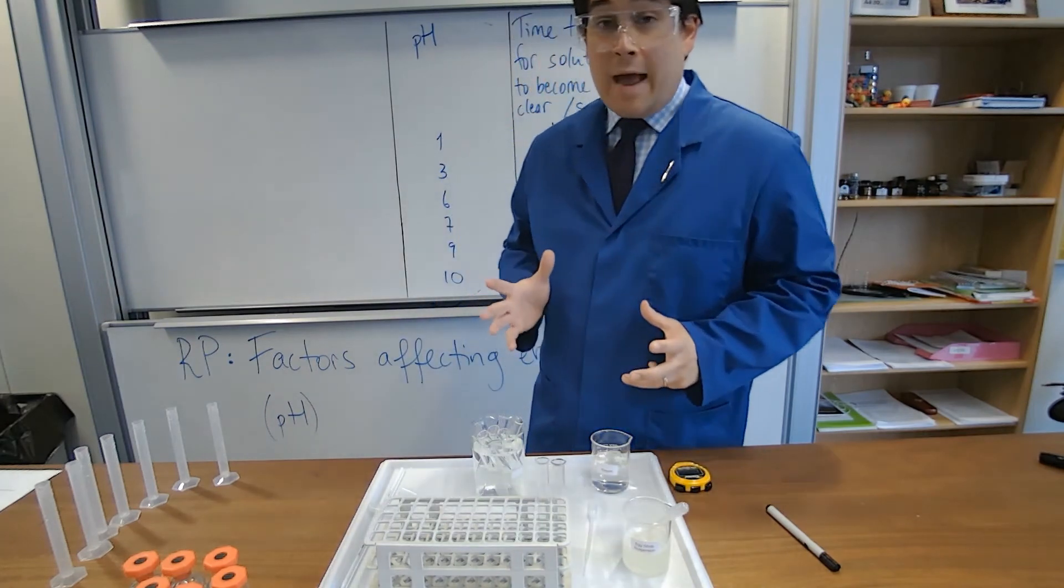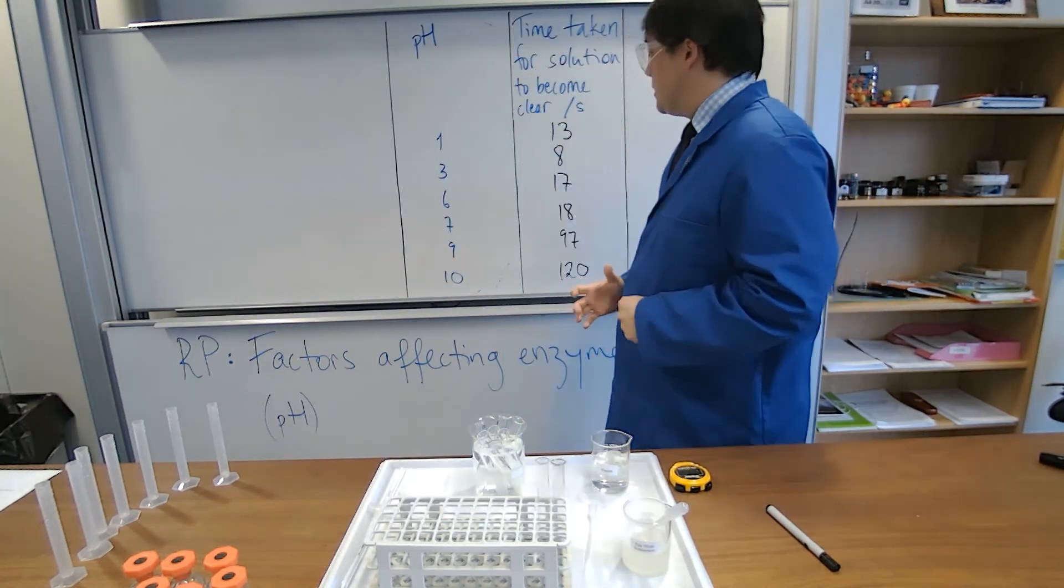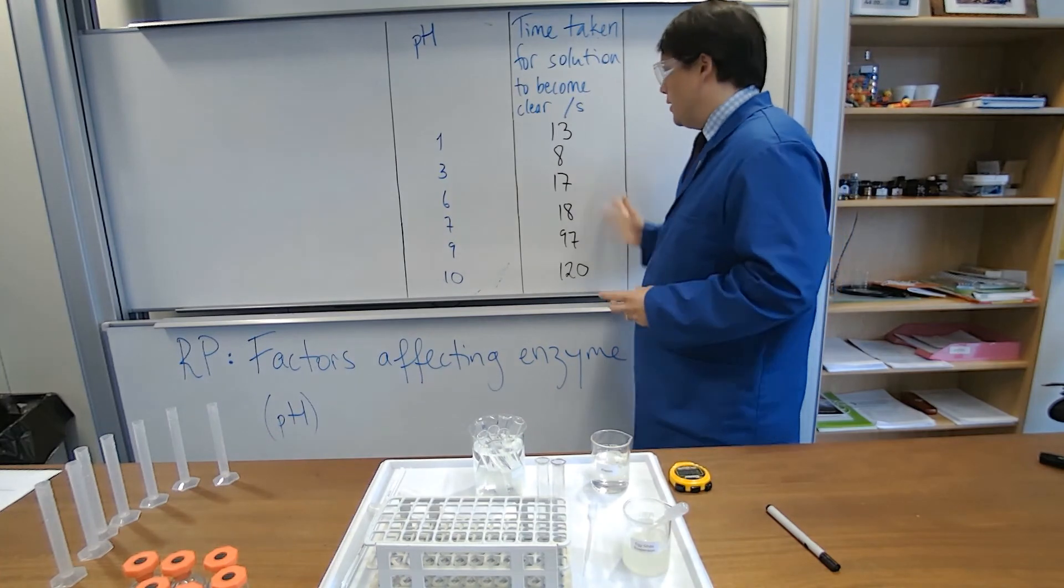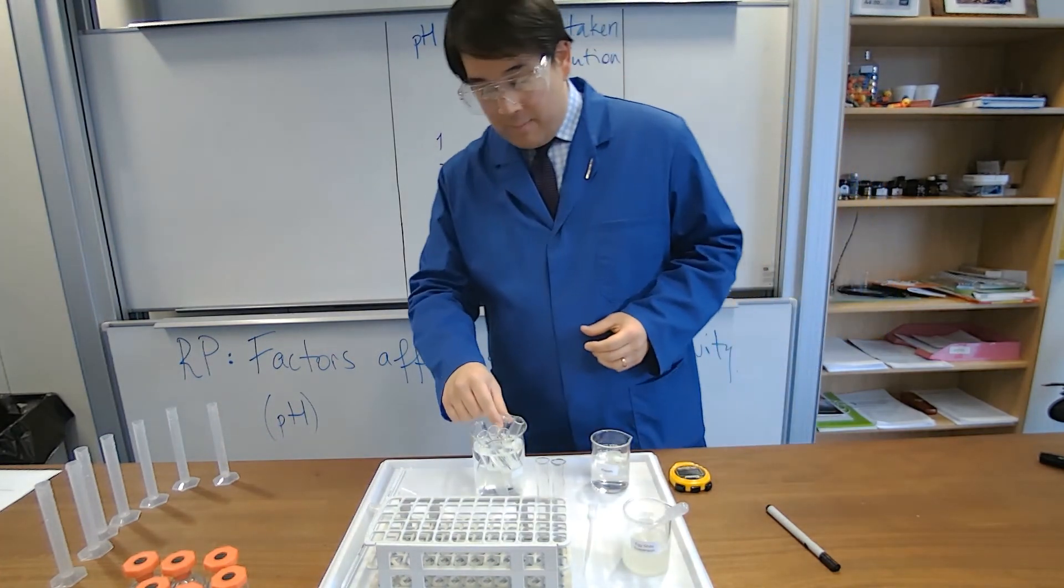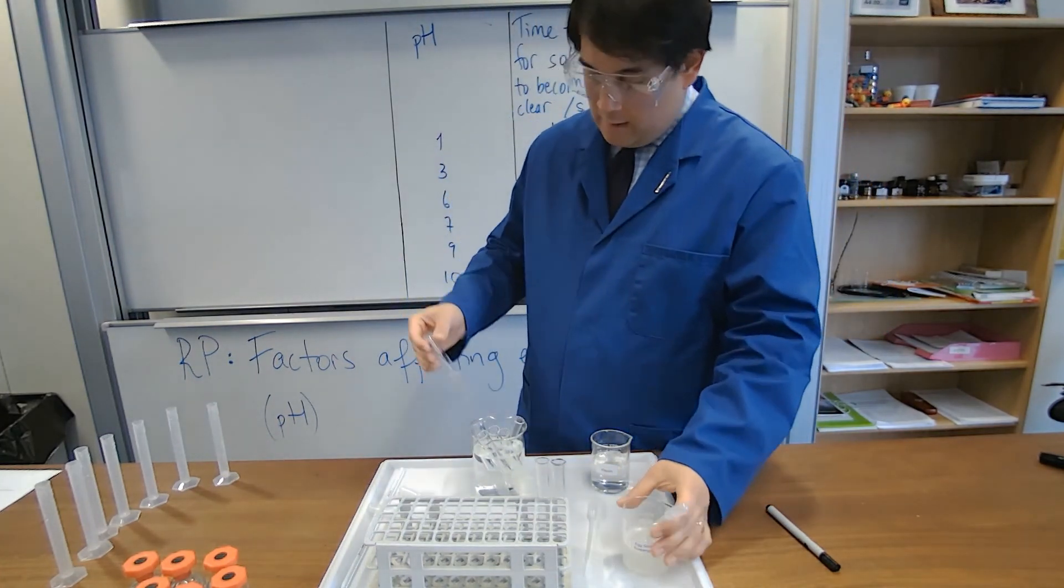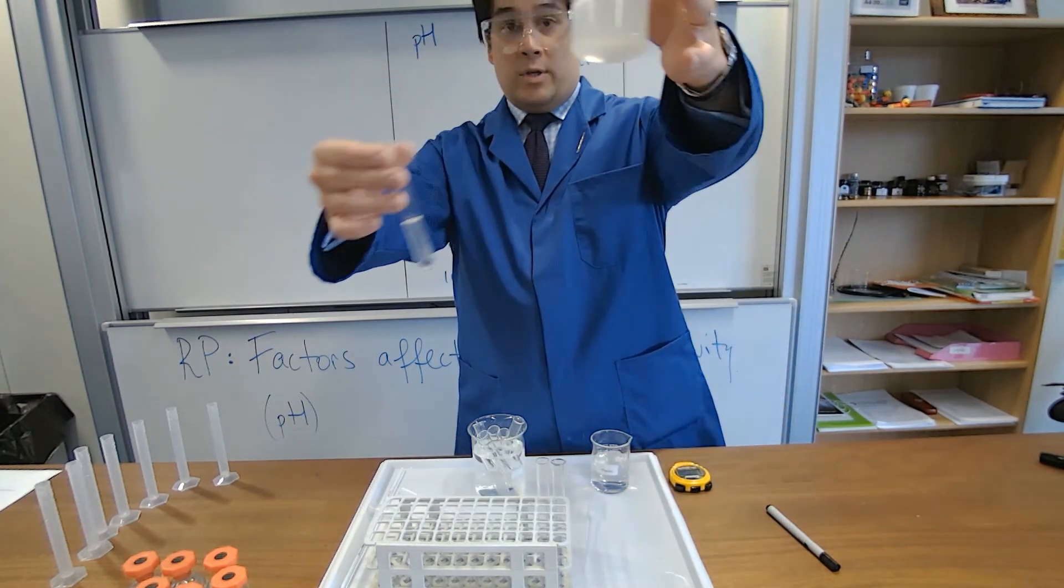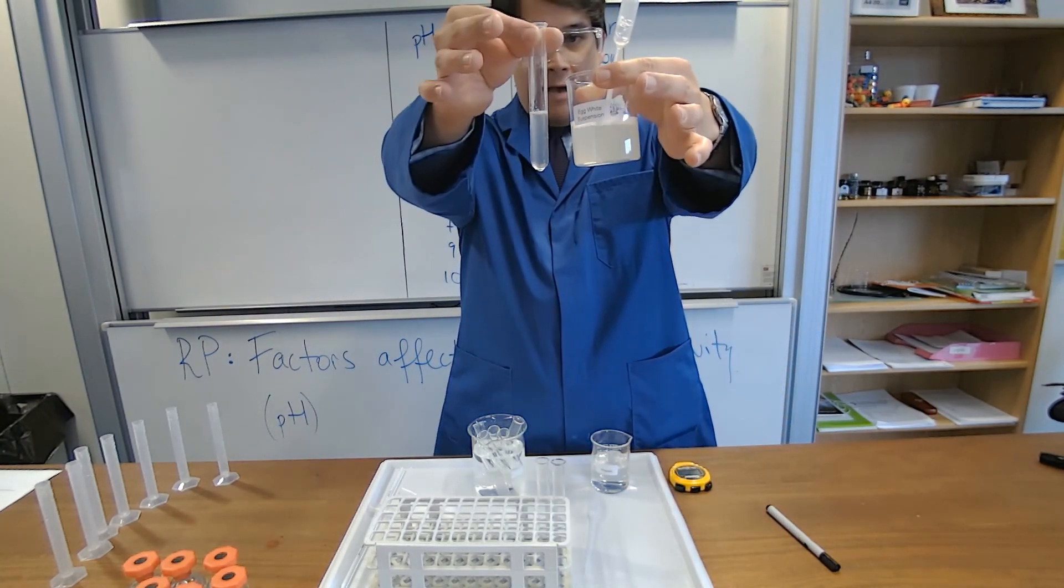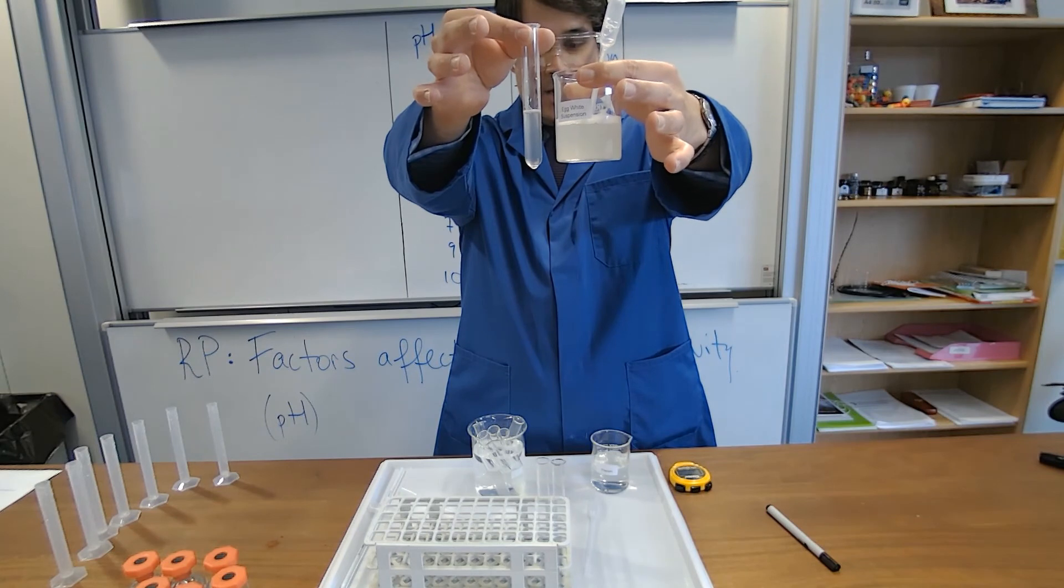So, because the reactions happen quite a bit quickly, I just wanted to make sure I had the chance to concentrate. Here are the times. What I mean by going clear is, as you can see here, here's one tube. This was the albumin before, this was the albumin after pepsin was added. As you can see, there's a slight difference.